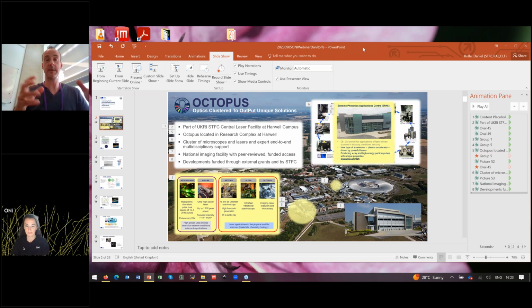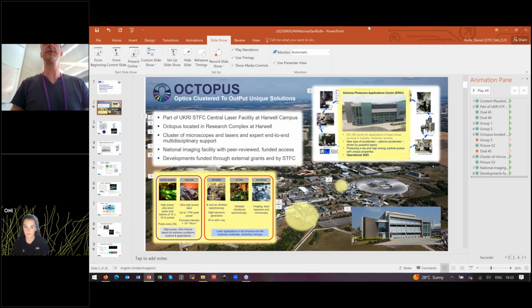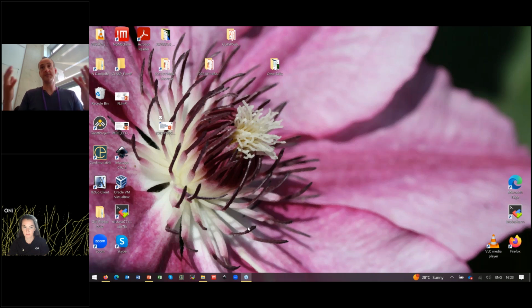So automation was essential to make it something that we could both apply for what interested us most and make available to users. So both the acquisition and the analysis automation were absolutely critical to getting this out to users. Basically, the results I just told you about, particularly on the non-small cell lung cancer, would not have happened. I think I said something like a 20-fold, perhaps to 50-fold, depending on which aspects, increase in efficiency. We would still be several years of full-time, painful, unsustainable work by certain colleagues away from having done that without the automation. So yes, absolutely critical.